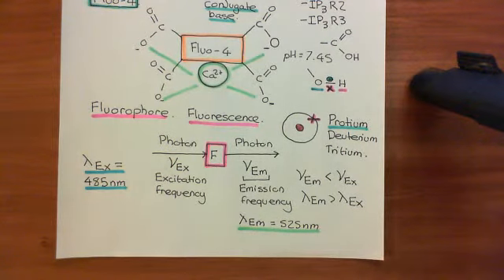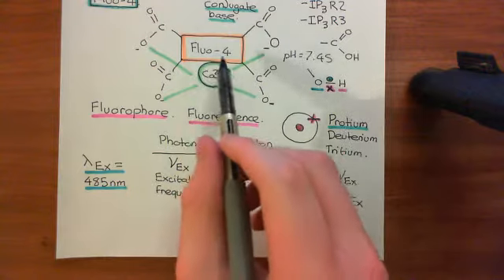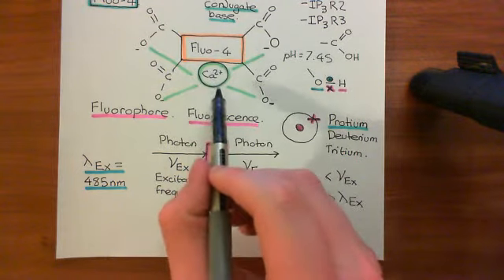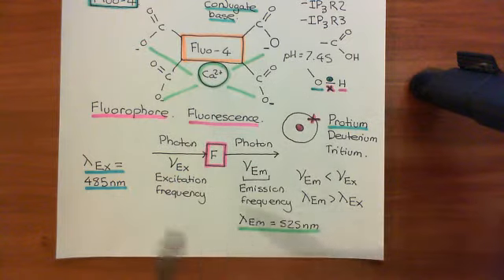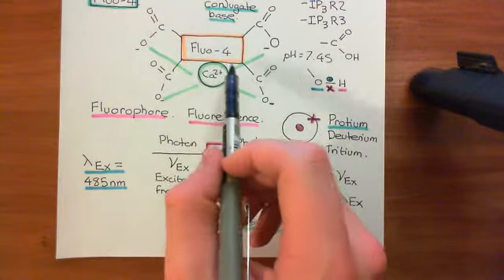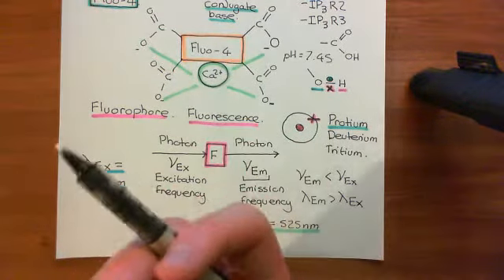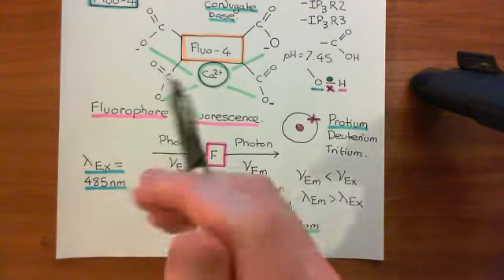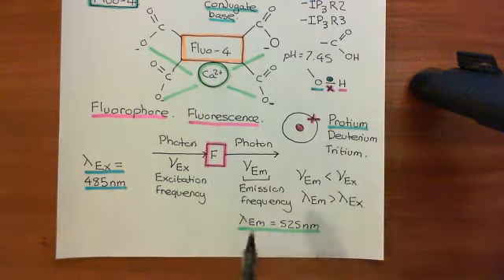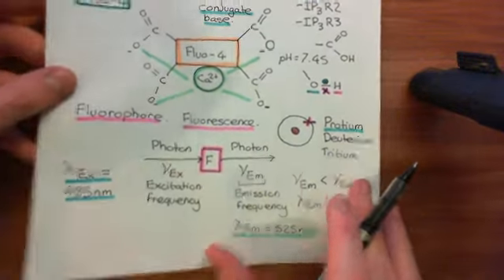Okay, and the more Fluo-4 molecules that are actually bound to calcium, the more fluorescence you get. And that's the genius of it, because what determines how many Fluo-4 molecules are bound to calcium? Well, it's the calcium concentration. So now we have a way to link calcium concentration to the fluorescence signal. And if you haven't understood that, don't worry, I'm about to explain it again.